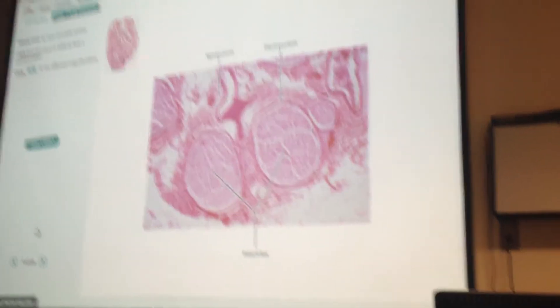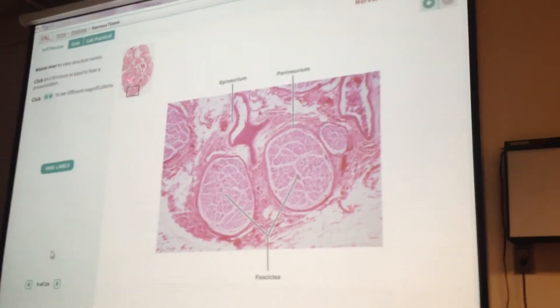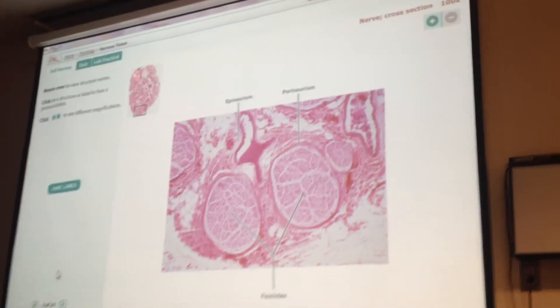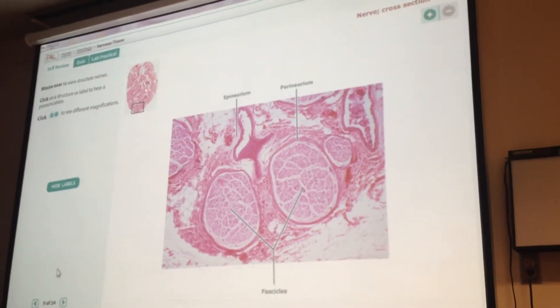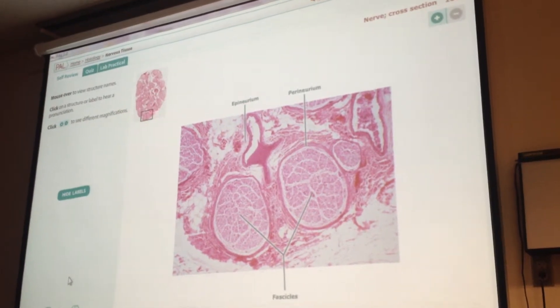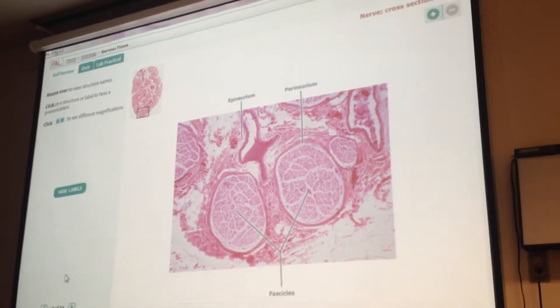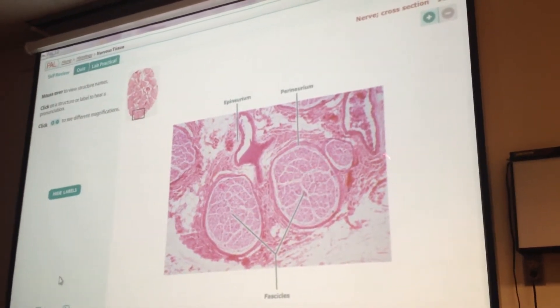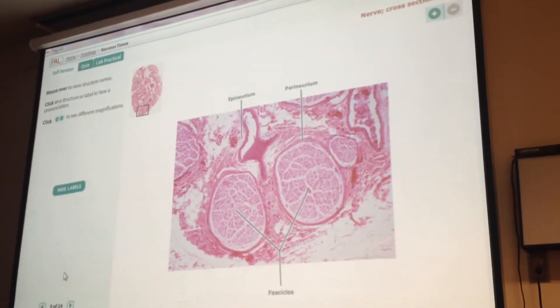Whole nerve up here — so this is like the whole nerve, something like that, up here. And then they've zoomed in, so you've got to notice that you're zooming in on that.